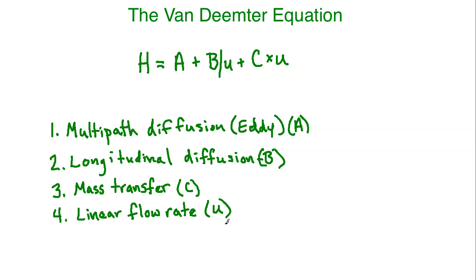And we're usually talking here about an amount of volume per some time. So maybe we're talking about 5 milliliters per minute or 2 milliliters per minute. Or whatever the given unit may be. We're talking about the flow rate of the mobile phase through the column.